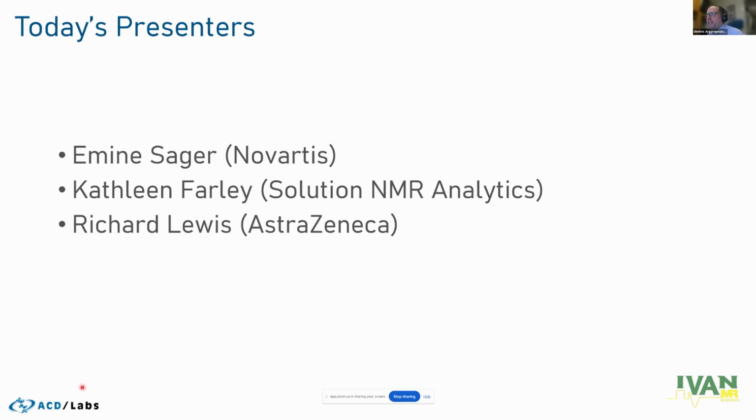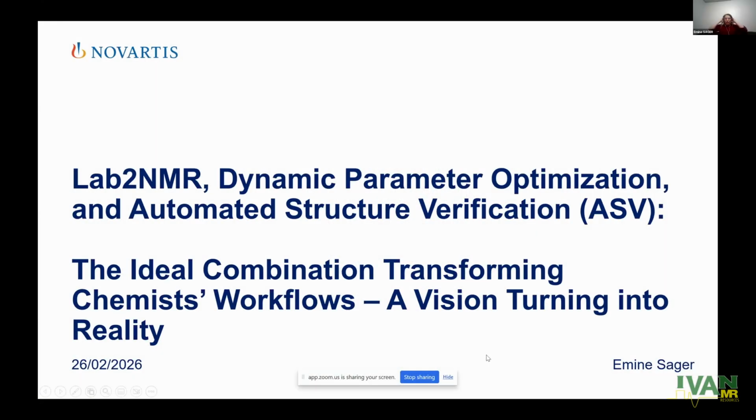So, without further ado, I think I can pass it over to the first presenter. Emin, are you there? Good morning, US, and good afternoon, Europe. I will show you how we integrate automatic structure verification in our workflow in Novartis. So the title of my presentation is Lab 2 NMR, Dynamic Parameter Optimization and Automatic Structure Verification, ASV. For us, it's the ideal combination transforming chemists' workflow. It was a vision that is turning into reality.